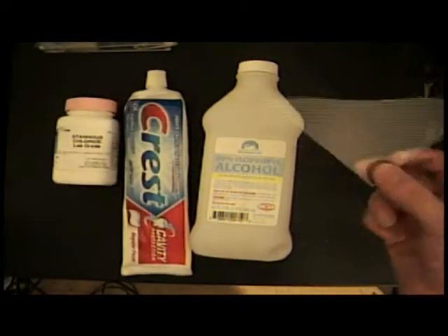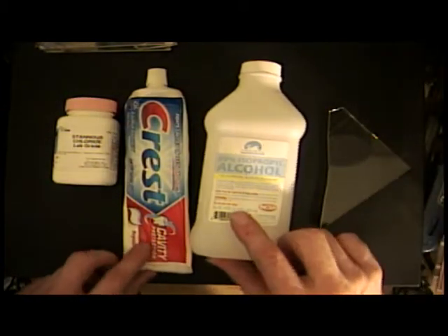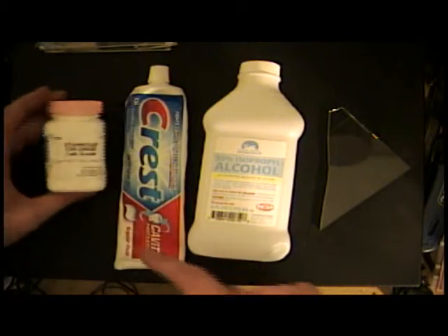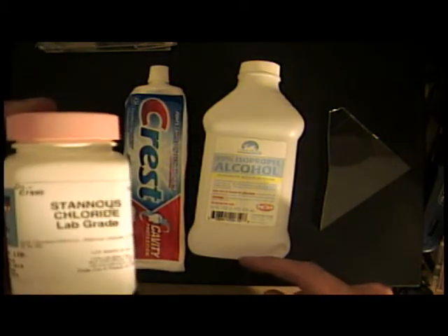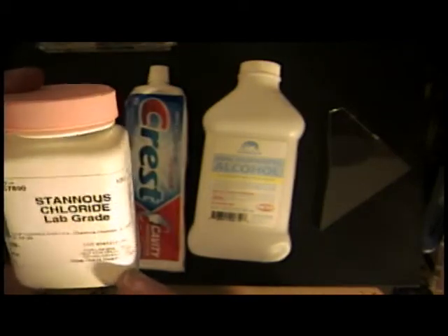and they've made conductive glass with a tin oxide layer by using stannous chloride. If you need some glass, you can get regular soda lime glass from a glass art store, some alcohol, some toothpaste as a light abrasive, and some stannous chloride from your chemical supply store. This is actually tin chloride.